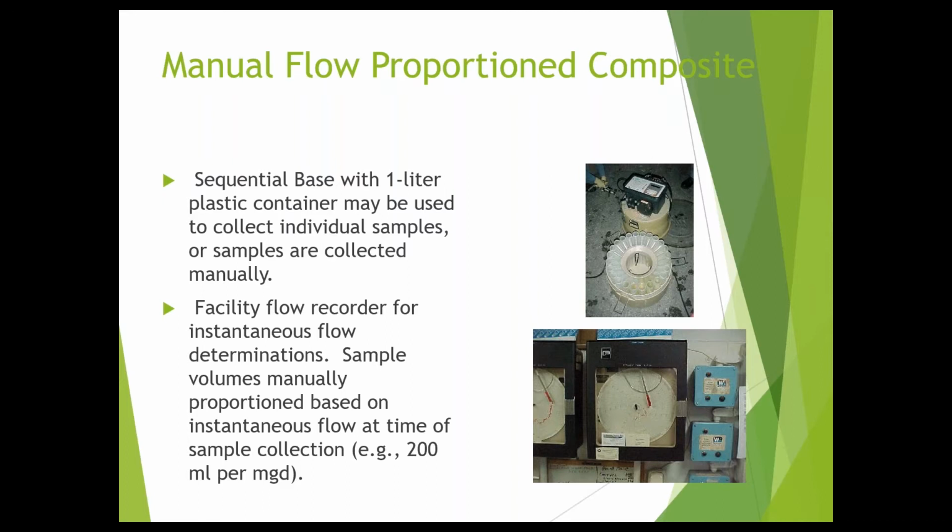All right, let's take a question. Let's see, I saw one earlier. Somebody asked, how long can a sample stay in the cooler? Can it stay in the refrigerated portion of the sampler? Well, that's also going to be based on what you're sampling. Remember, if that refrigerator is refrigerated correctly at less than 6 degrees C, it is preserved and it can stay in there. Again, it's based on what you're sampling.